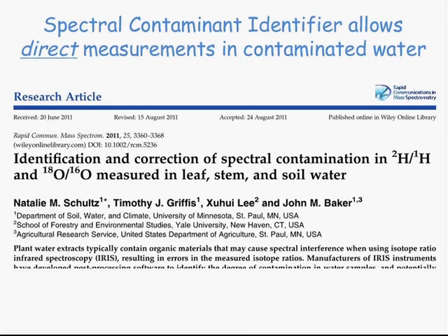Okay. Then the next question is, in a highly humid region, H2O greater than 30,000 ppm, do we need any kind of correction in vapor isotope data? You certainly wouldn't need a correction. The instrument can measure at those highly humid levels. The one concern that I would have is that you would need to make sure that the lines weren't condensing into the instrument.